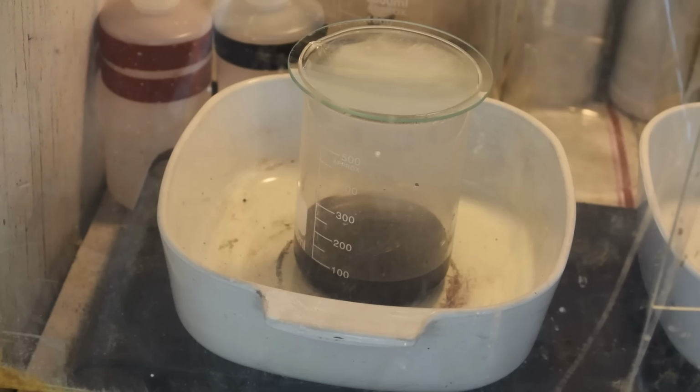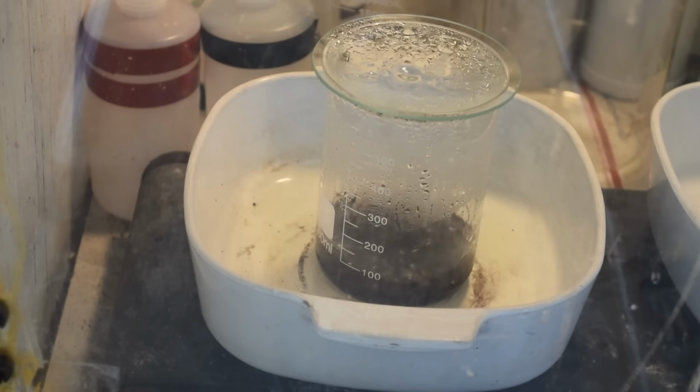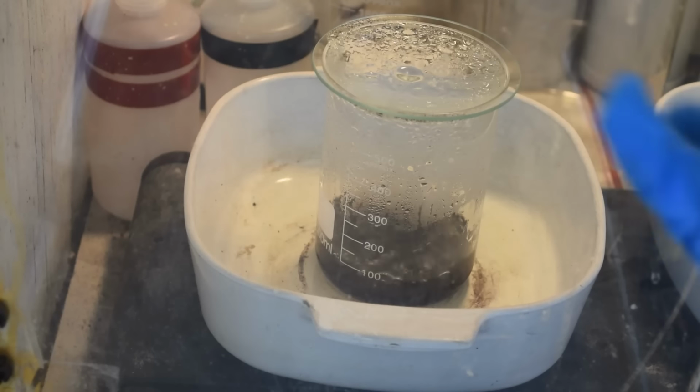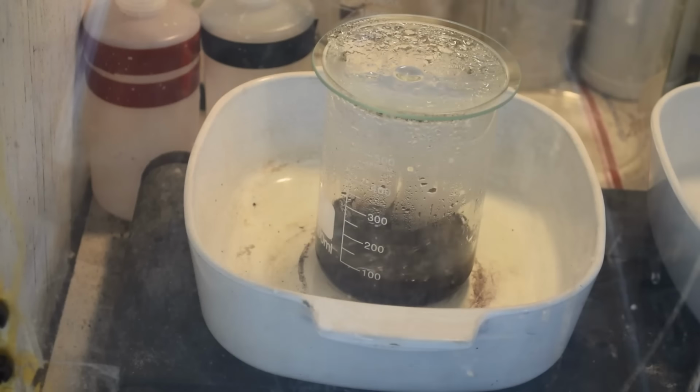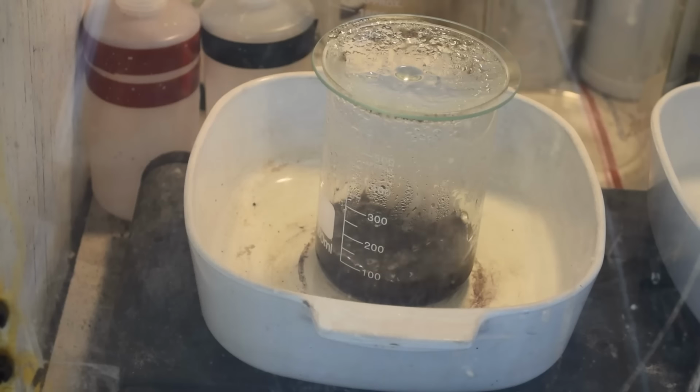Oh, just waiting for it to come up to a boil again. Well, it got up to a boil pretty quick. I'm going to let it boil for a couple more minutes and then take it off. And we'll decant off this liquid and start giving it distilled water boils. I'm thinking at least three, to get the acid out of it. And then we'll dry it out and weigh it.